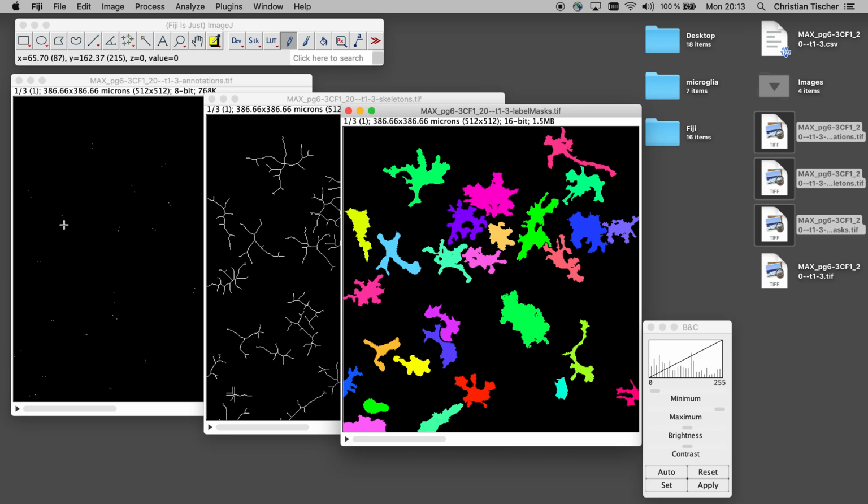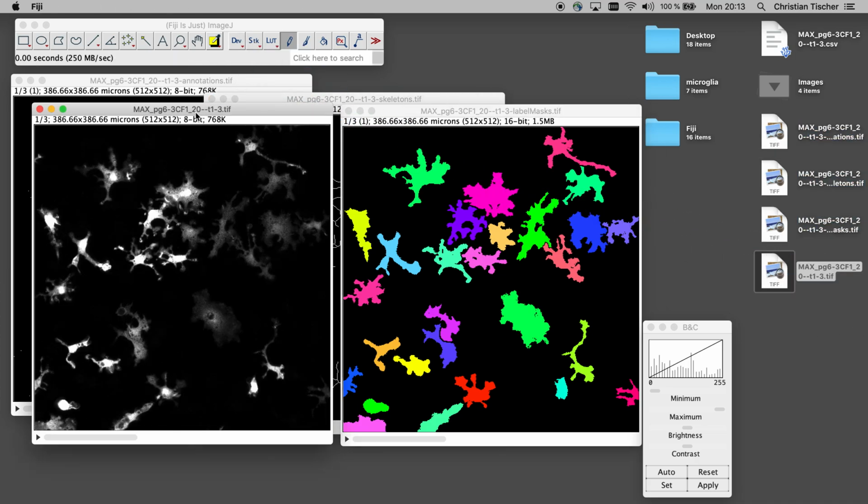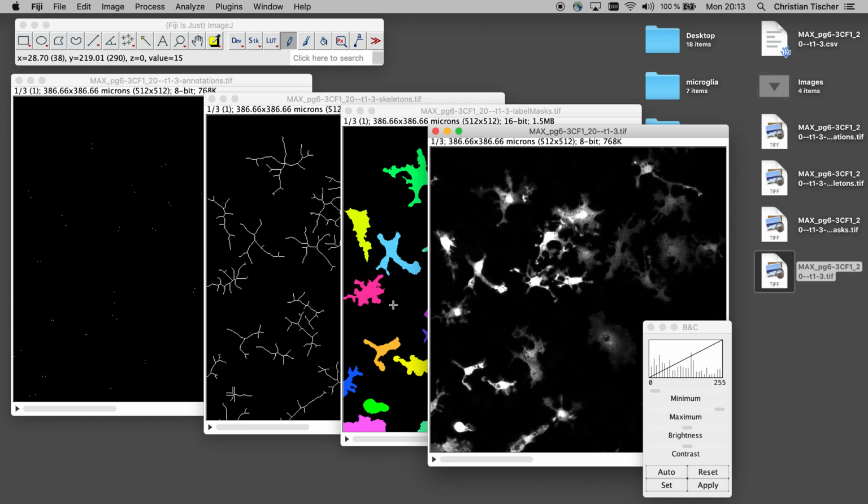And then here we have 2 points per cell. And to explain that, I also need the intensity image. So we found it also useful to measure where is, after some blurring, the brightest point in the cell. That would be here, because that's very likely the position of the cell soma. And we also measured the centroid of the cell. And we thought maybe it's a useful feature to see if they coincide, like in that cell, which would be a cell that's actually relatively round. Whereas here we have a cell that's sort of asymmetrically elongated, and then there is a certain distance.